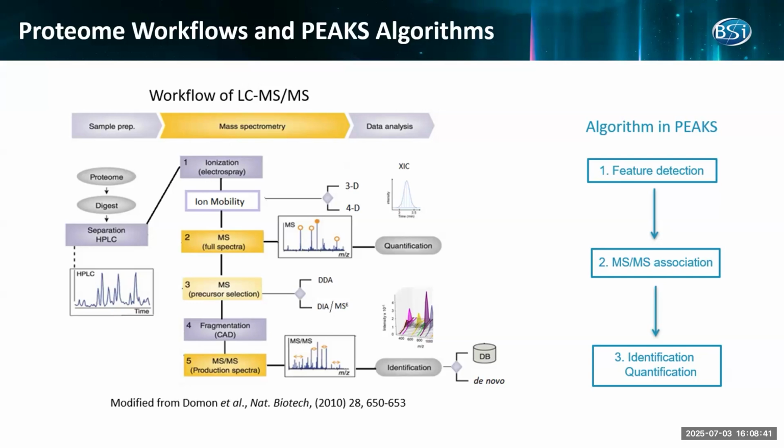It contains all the information regarding sample processing and the mass spectrometry method: for example, whether it is DDA or DIA, whether it contains ion mobility, which enzyme was used, and which instrument was used, for example Astral, timsTOF HT or ZenoTOF 8600. It also reflects whether your sample is well known and has very good database information, or whether your research topic doesn't have enough proteome information. All of that is contained in the data.